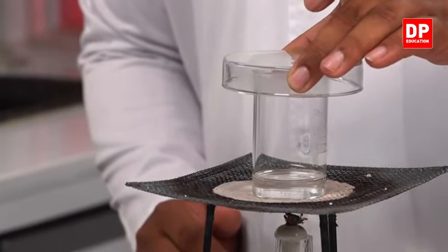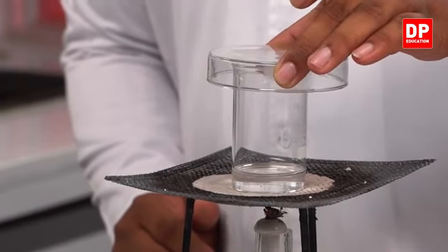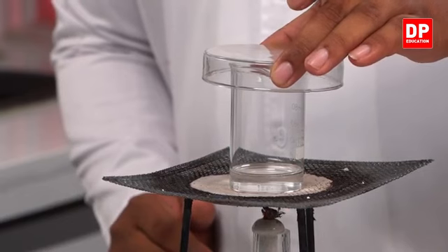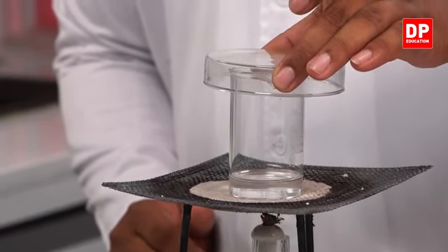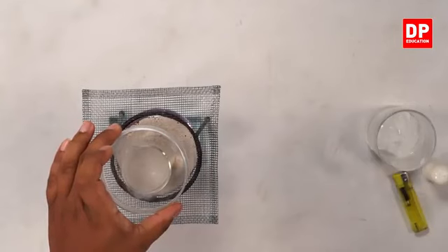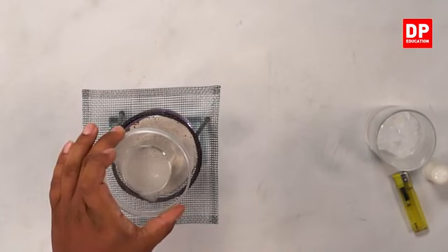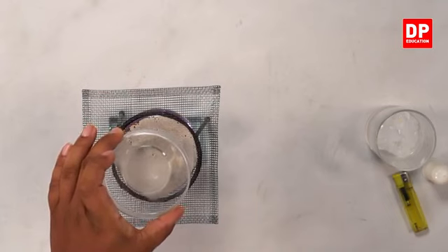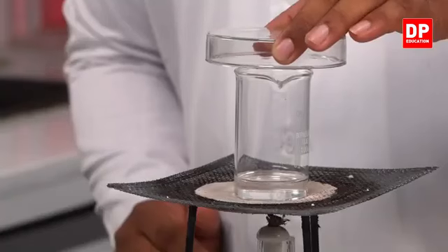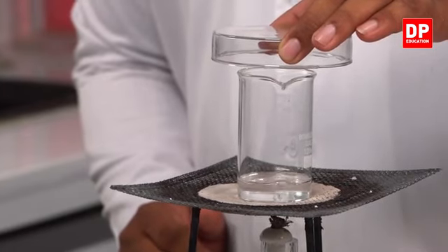Here you can observe, when I keep this at the top of the beaker, some kind of vapor is getting formed on the petri dish. See, you can observe it clearly. Some droplets are getting created on the petri dish. So this vapor is getting deposited on the petri dish.